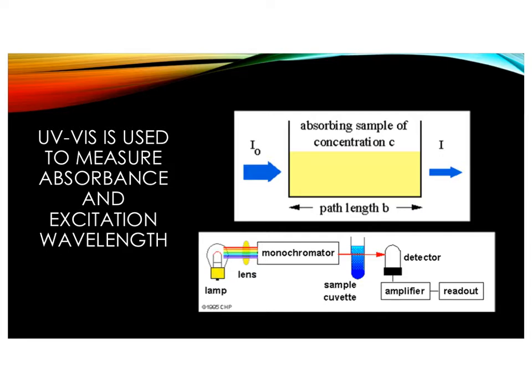We will use a UV vis to determine your sample excitation wavelength before using the fluorimeter. A UV vis works by a source sending photons through a monochromator, source here, monochromator here, to single out a specific wavelength to send through your sample. This will be your incident light. The more concentrated your sample is, the more the particles in your sample will absorb the incident light, which causes a decrease in light to reach the detector, which then will be transmitted light. The instrument calculates the difference in transmitted light to incident light and displays a spectrum relative to the wavelengths absorbed by your sample.